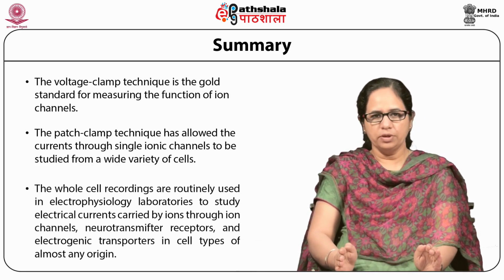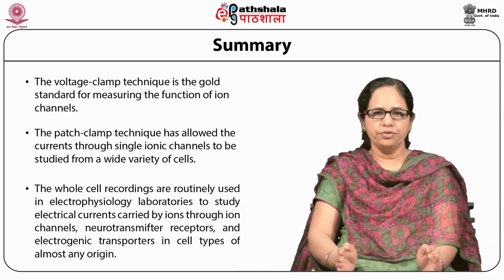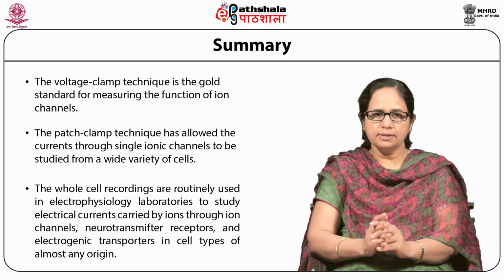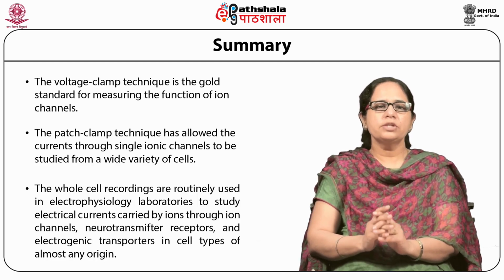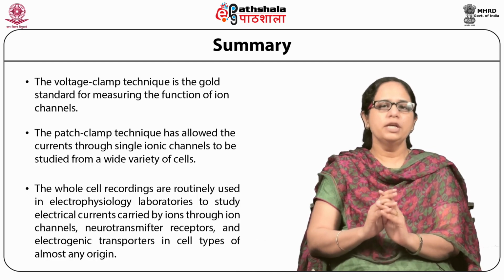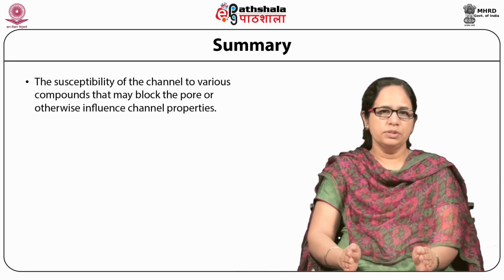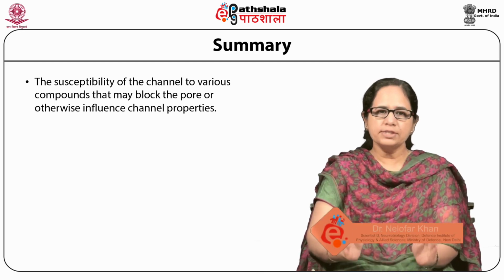Whole cell recordings are routinely used in electrophysiology laboratories to study electrical current carried by ions through ion channels, neurotransmitter receptors, and electrogenic transporters in cell types of almost any origin, and the susceptibility of the channel to various compounds that may block the pore or otherwise influence channel properties.